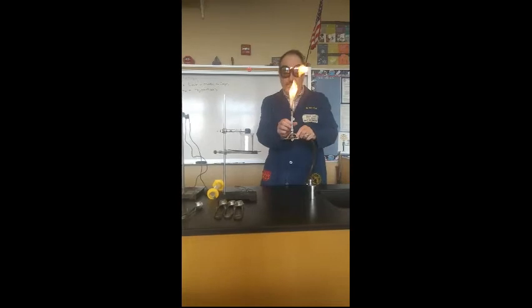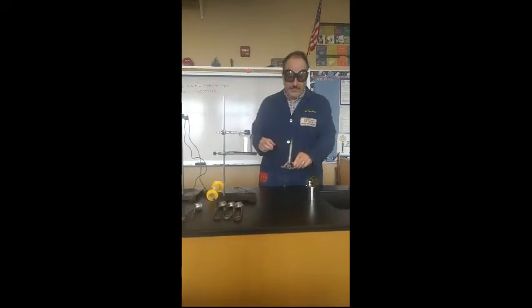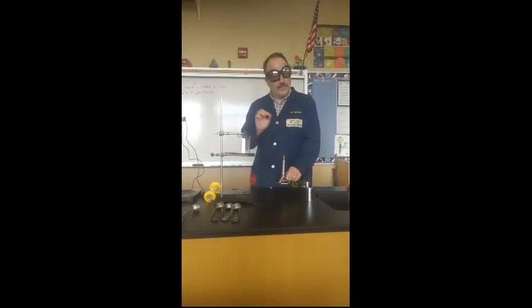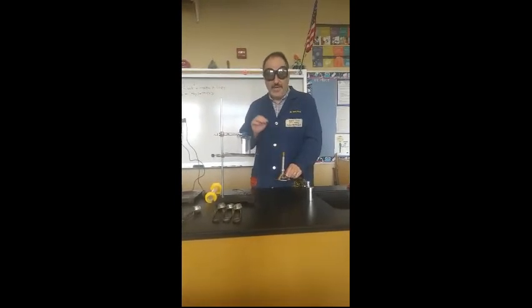And the way that you increase the temperature is by reopening the air vents, okay? So unscrewing the barrel, okay? If you do it a little bit, then you'll notice it turns blue. Now, this right here is a little bit hotter flame. This is, though, the coolest flame that we would ever be using in a lab.